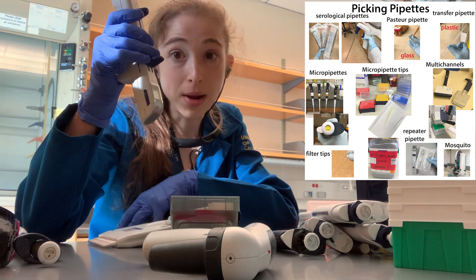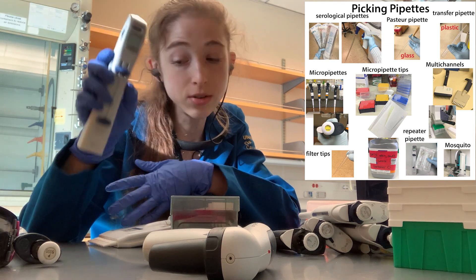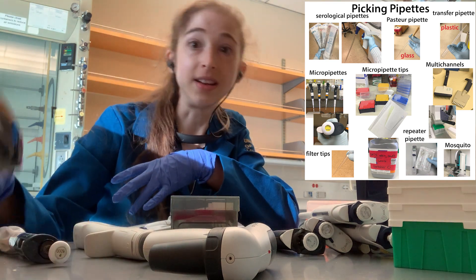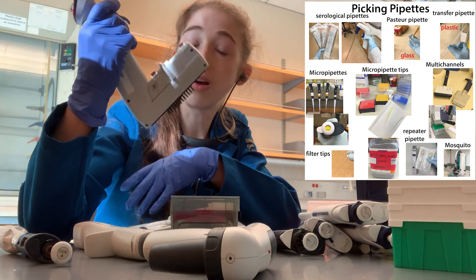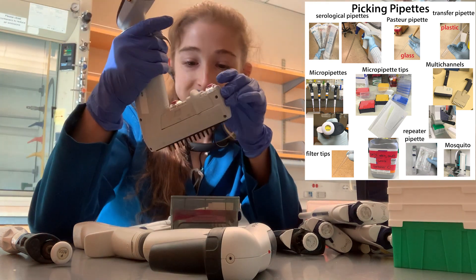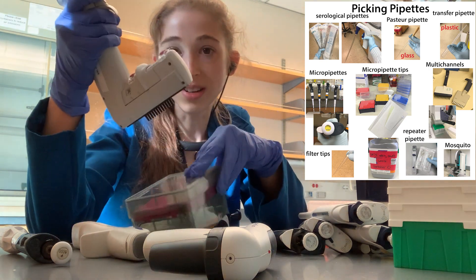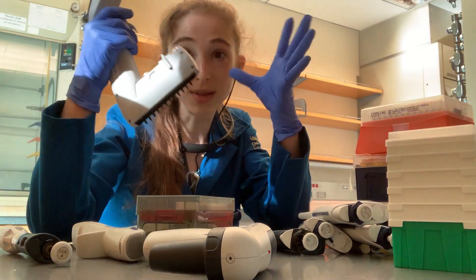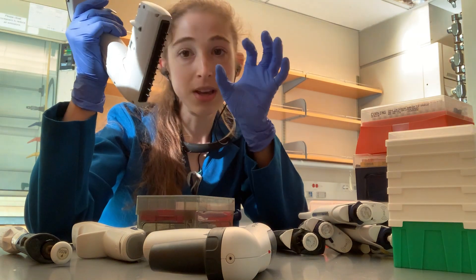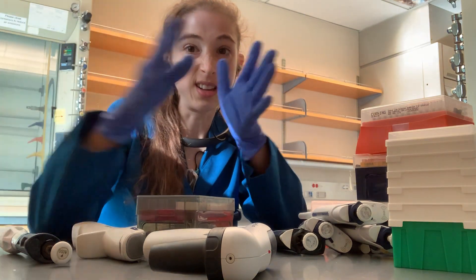A repeater pipette is going to let you do the same volume over and over and over. And this really cool expandable thing that the lab has — it's like clip-tip, but you put it in and then it expands, which can be super helpful if your wells or whatever are a different size linked across.